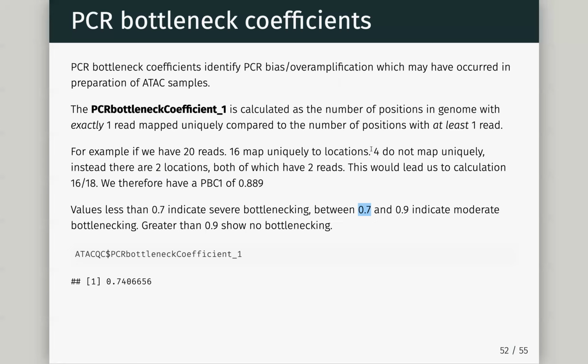I'm going to have some exercises here, and they do start quite low level, but you do end up creating an actual bigwig of the different types of signal. What is kind of cool here, as you can see, is that you can see the nucleosomes piling up either side of the TSS, which is often the case. You'll have a -1 and +1 nucleosome.